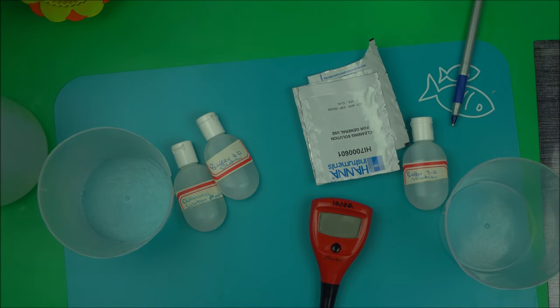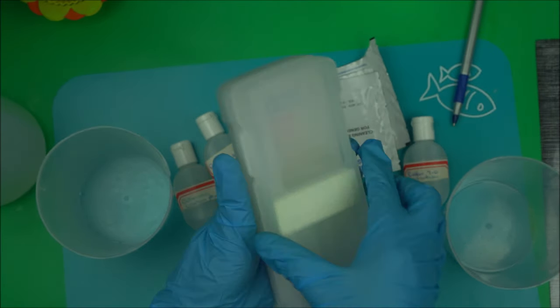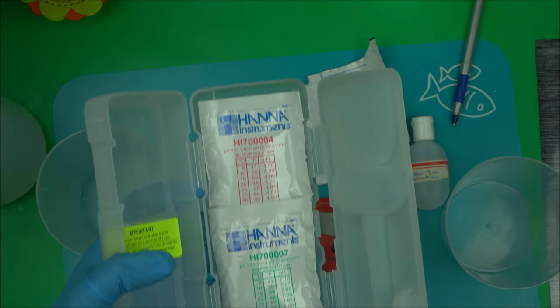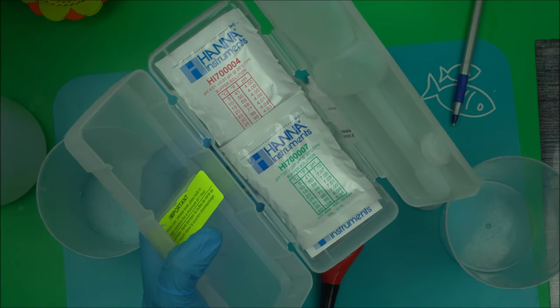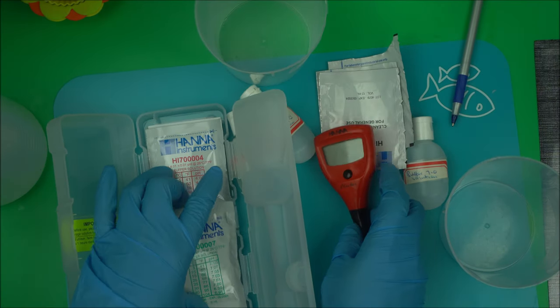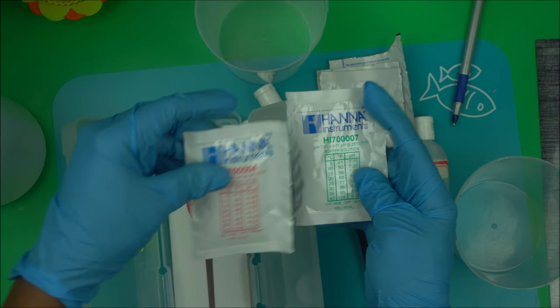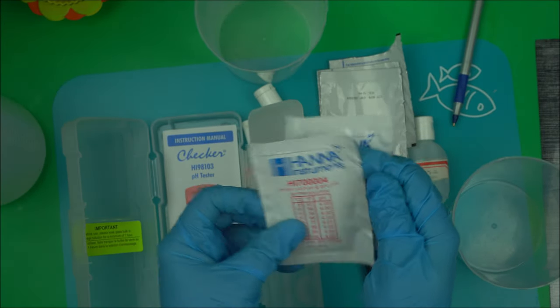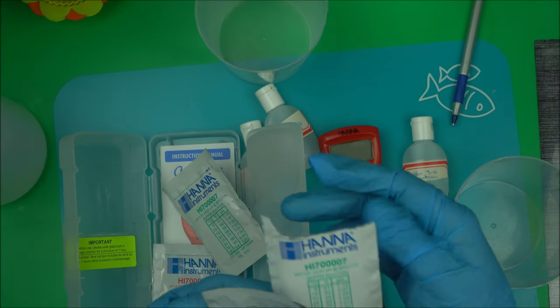It's going to come in this box. In the box you'll have different buffer solutions. Buffer solutions are solutions that you use for calibration. The buffer solutions that come with this HANA pH meter are the 7.01 and the pH 4.